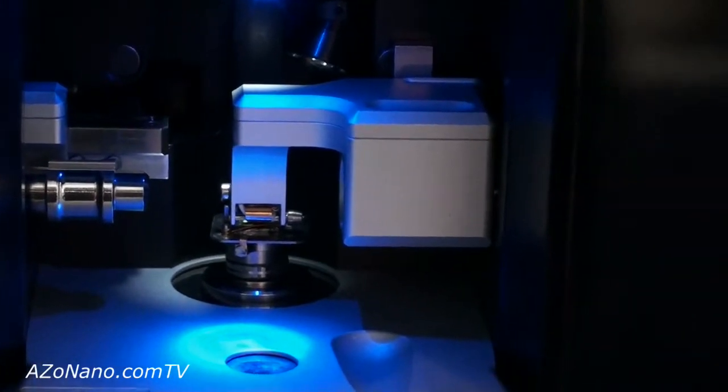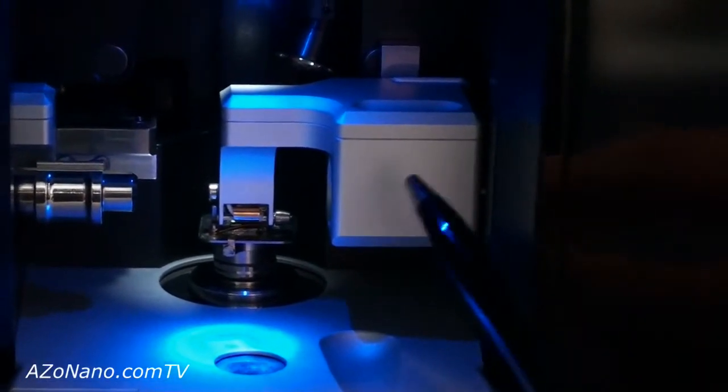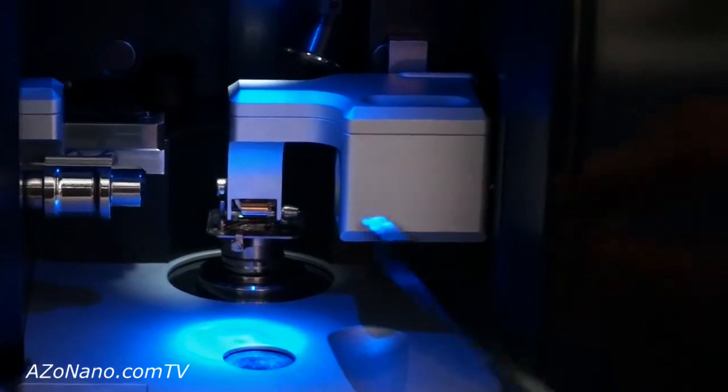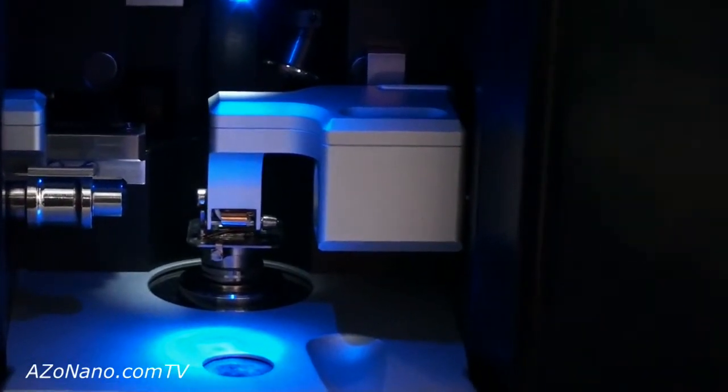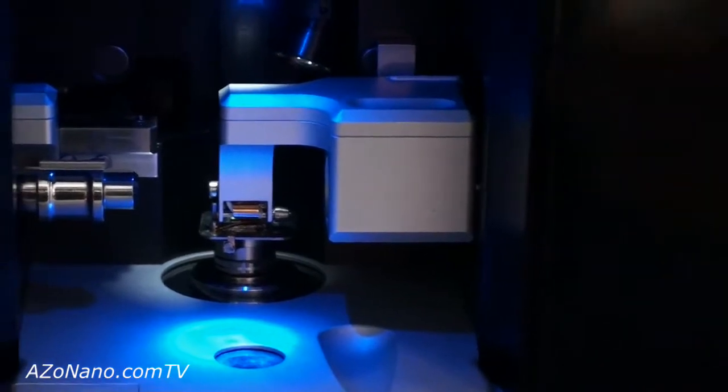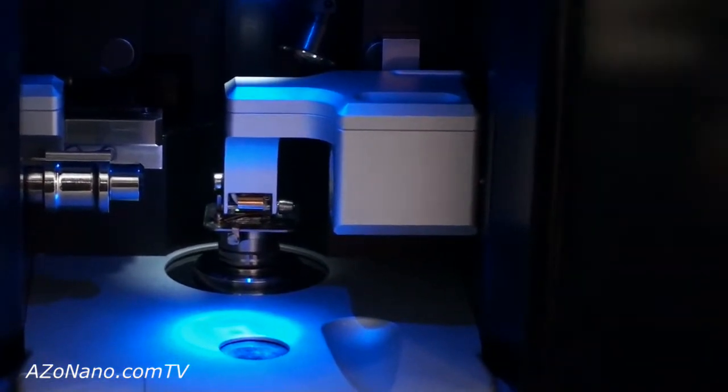Inside the chamber here you can see two measuring heads: an atomic force microscopy head and a scanning tunneling microscopy head. We can control the exchange from the software. I'll show you how to do this.